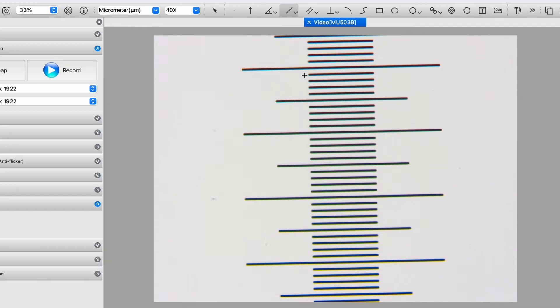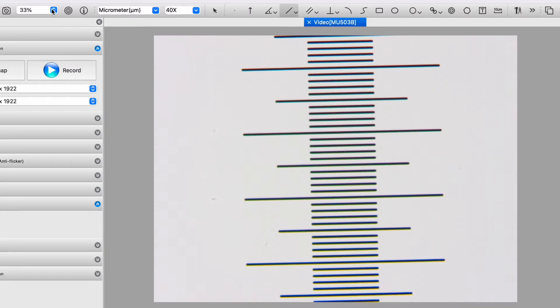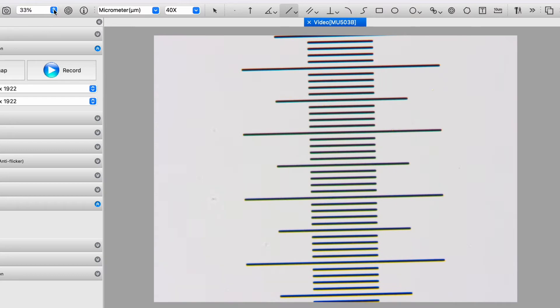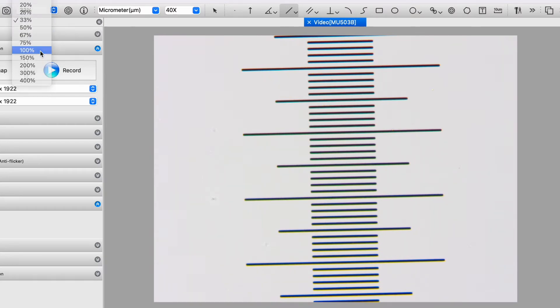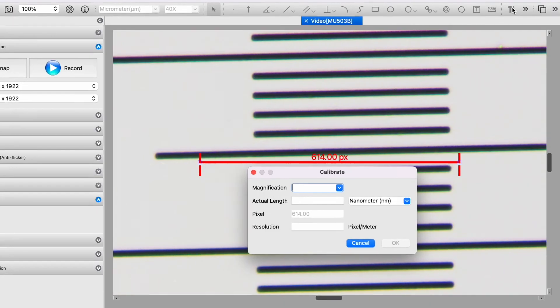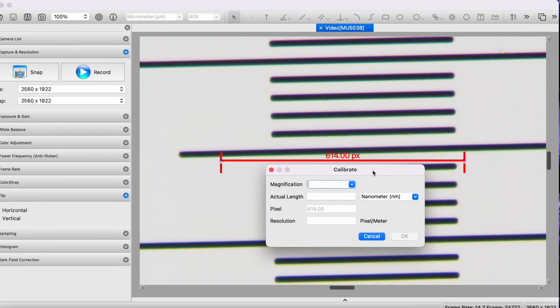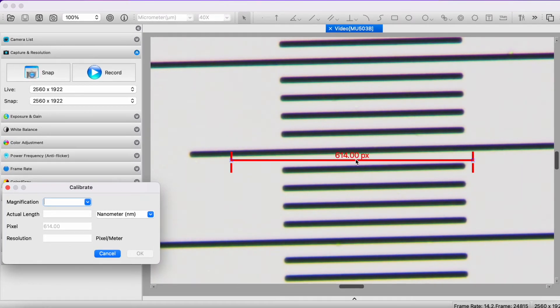The first thing we will do before starting the calibration procedure is to set the digital zoom to 100%. Now that is set — just making sure we're in the best focus we can get. Now we go over to the right-hand corner and click the calibrate icon. The calibrate window comes up. I'm going to move that to the side, and then we get this line which we will position accordingly.